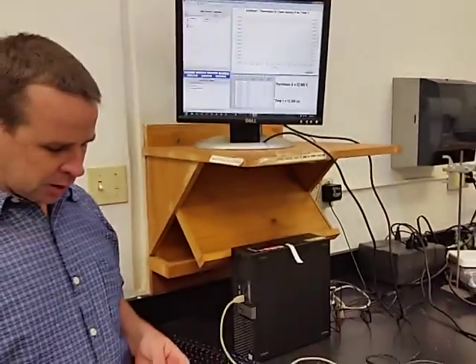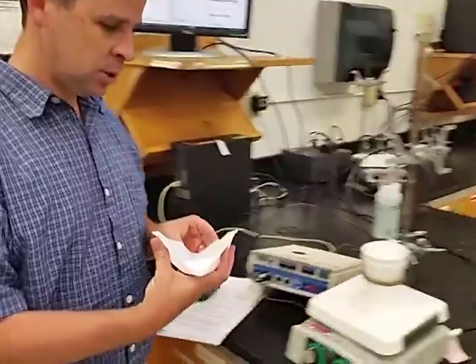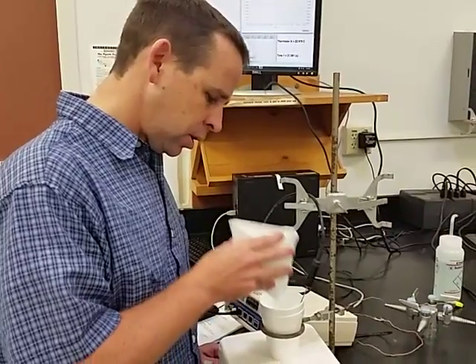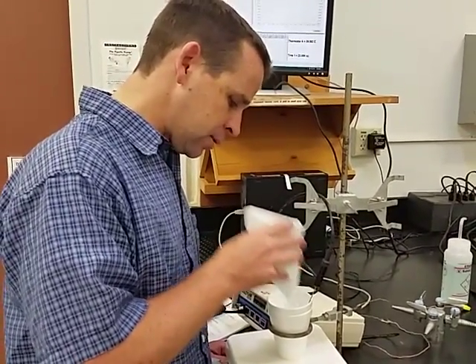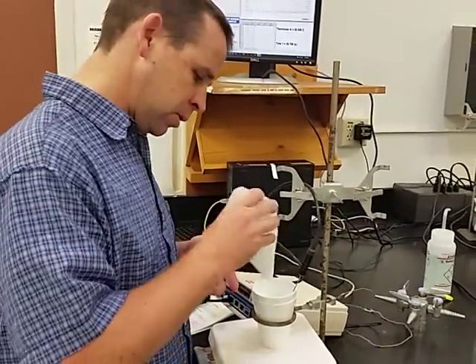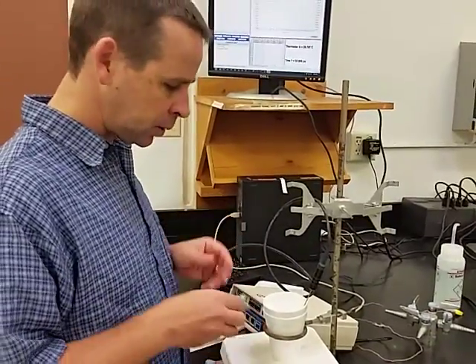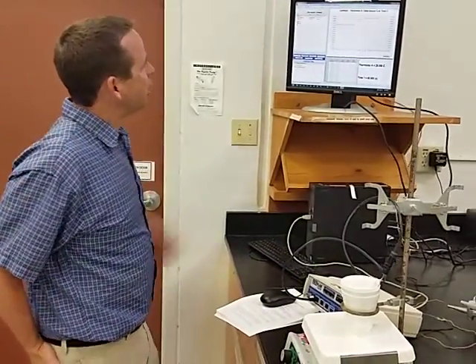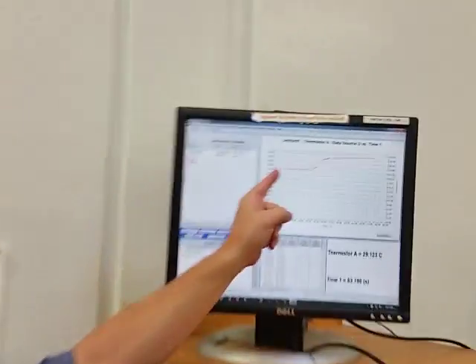Okay? Now, I need to make sure this stuff all drops in here. And in this one, it was the case that these were all powdered. I need to make sure it all goes in there. There we go. This was all very powdered, so it wasn't a big deal. But you have to make sure that the salt that you're adding is nice and fine. If it's clumpy, then they'll just get down to the bottom and you'll have a lot that doesn't dissolve. So that's a problem.